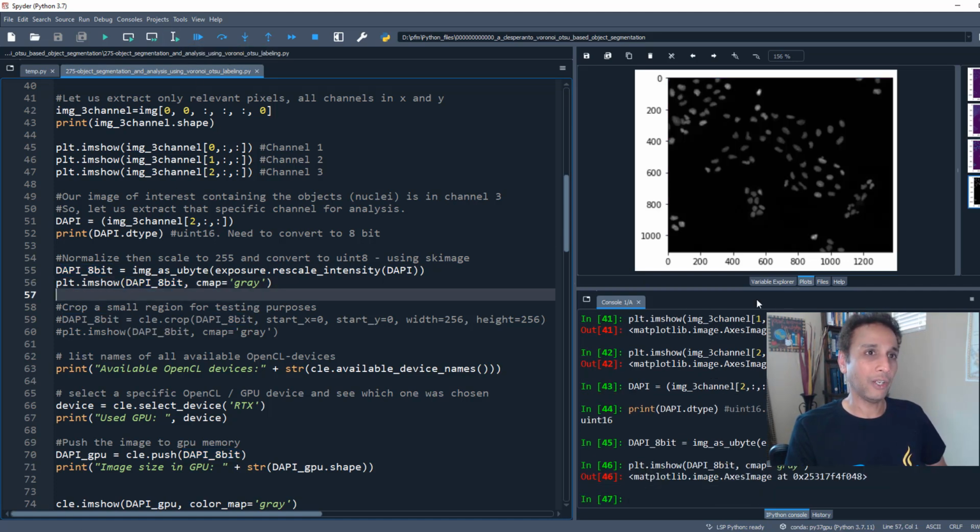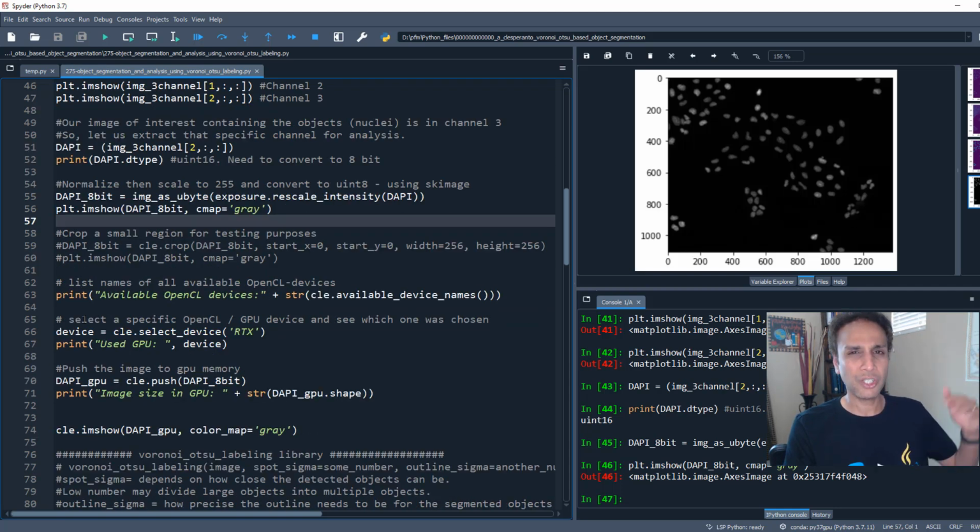So let's go ahead and look at this image. This is exactly where we are right now. If you already have an image that looks like this, a single channel, ignore whatever I just showed you right now. Just start with this. Go ahead and imread your image and start from here. This is just extra stuff that I'm giving you.